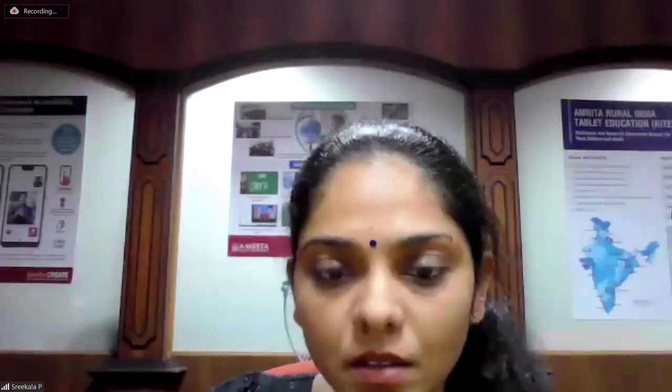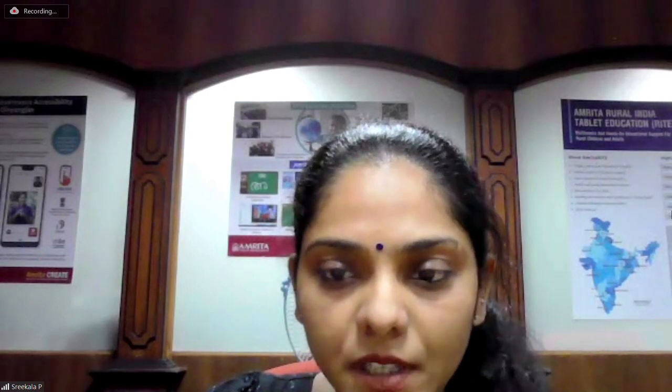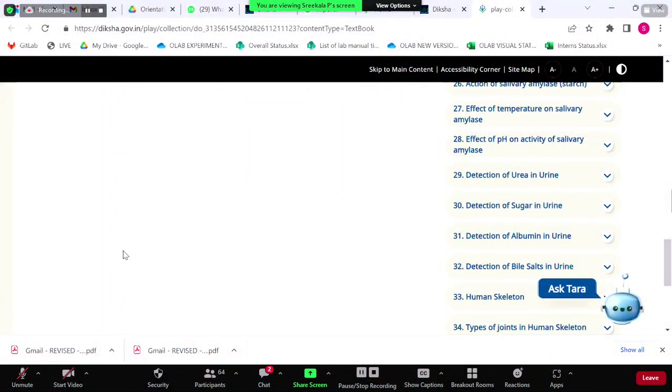So as you can see here from the virtual labs e-content, select the class you want to explore. So today I'm exploring class 11, biology. So when you click on the English medium, the subjects appear. Click on biology. Here you see on the screen, the lab manual gets displayed on the left side. Scroll down. So be prepared, teachers, before going to class, you can be prepared as to which experiment number you are going to do.